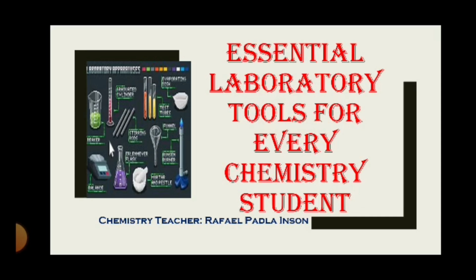What is the second objective you should learn? Demonstrate safe handling. Apparatus is not just about knowing its knowledge, but of course you have to hold it with your hand, practical handling.